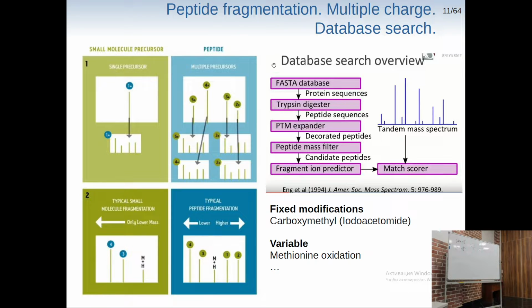Then, even if you have nucleic acid, we translate it into possible protein sequences. The program can digest it in silico to get those peptides which can be found in reality. We can add some post-translational modifications, and which modifications we actually have to add if we're working, for instance, with gel excised spots? What have we done to our protein in 2D electrophoresis before we get it for analysis?